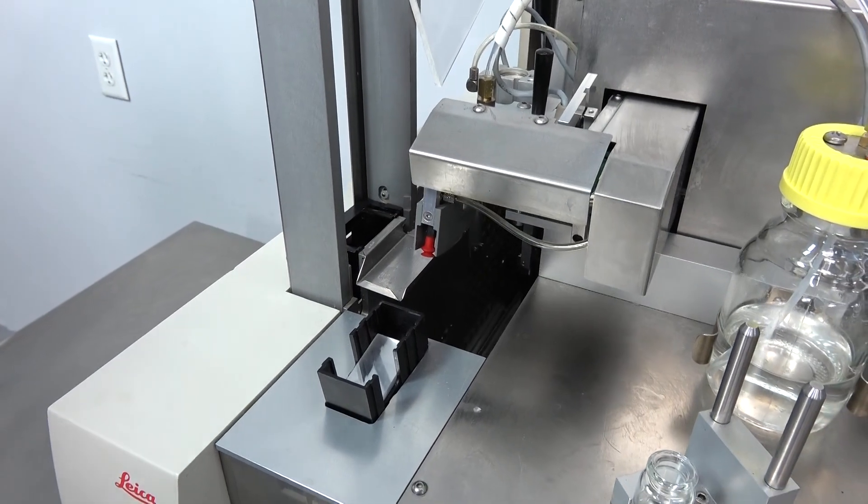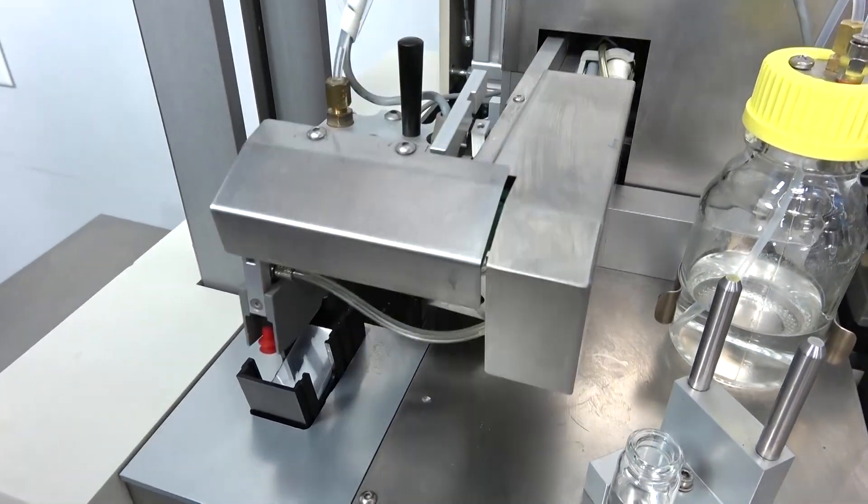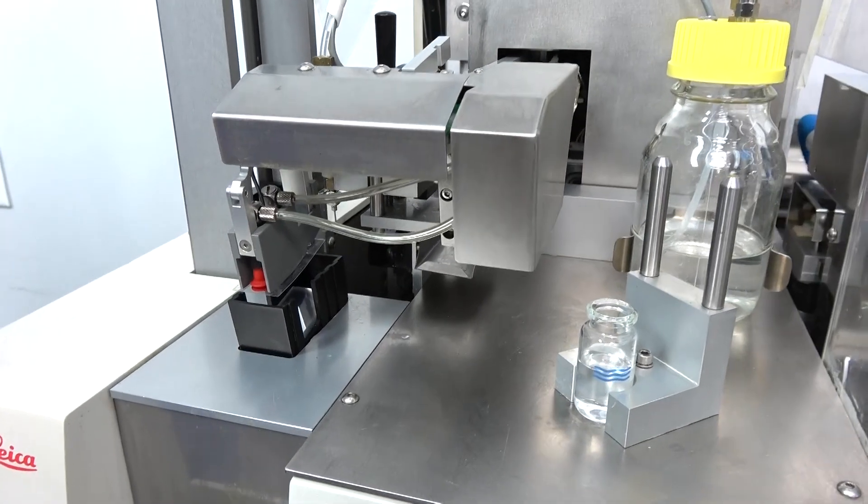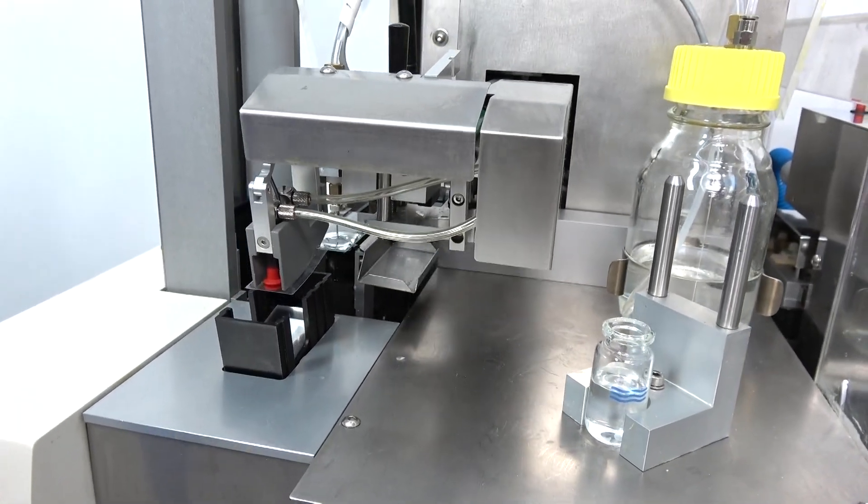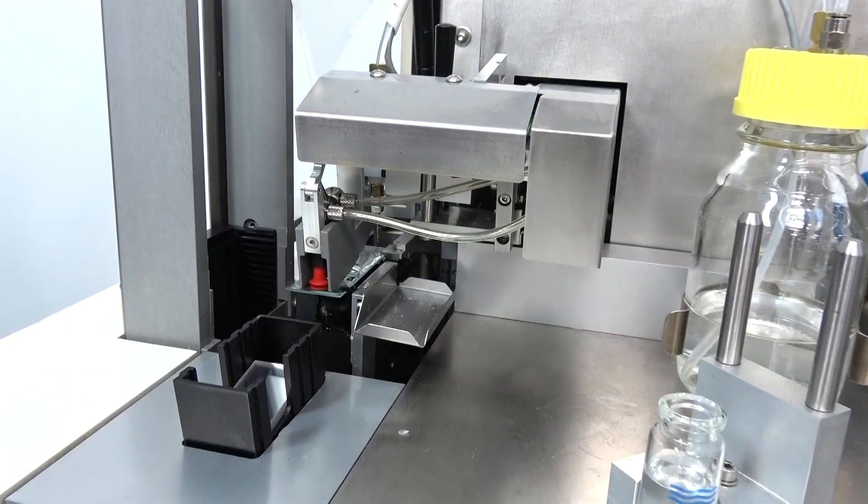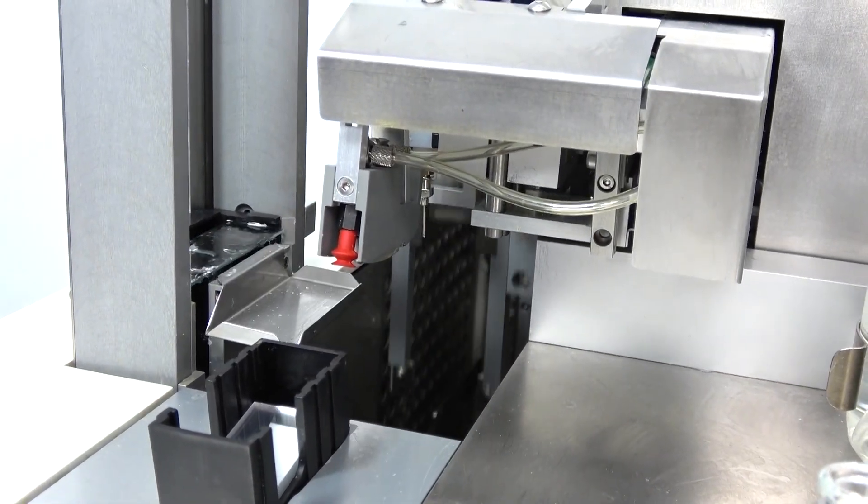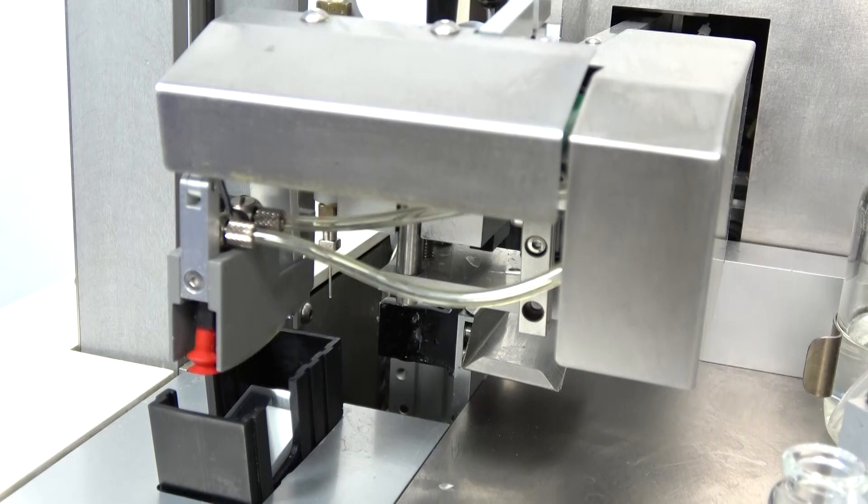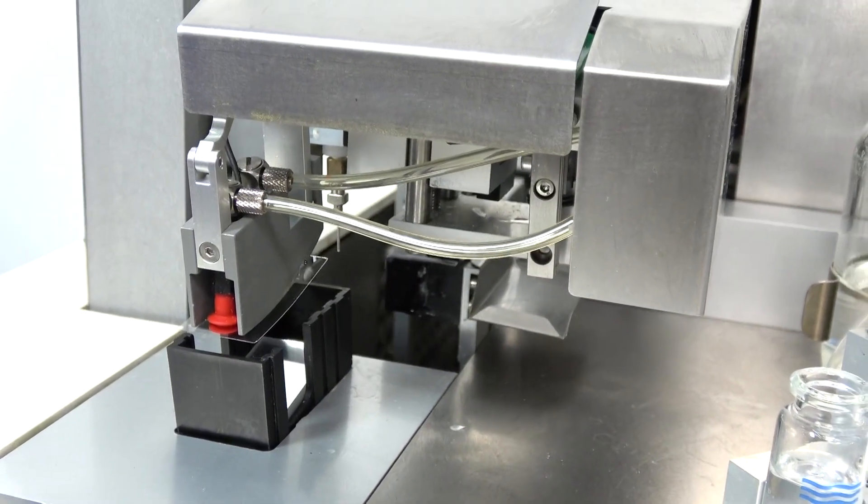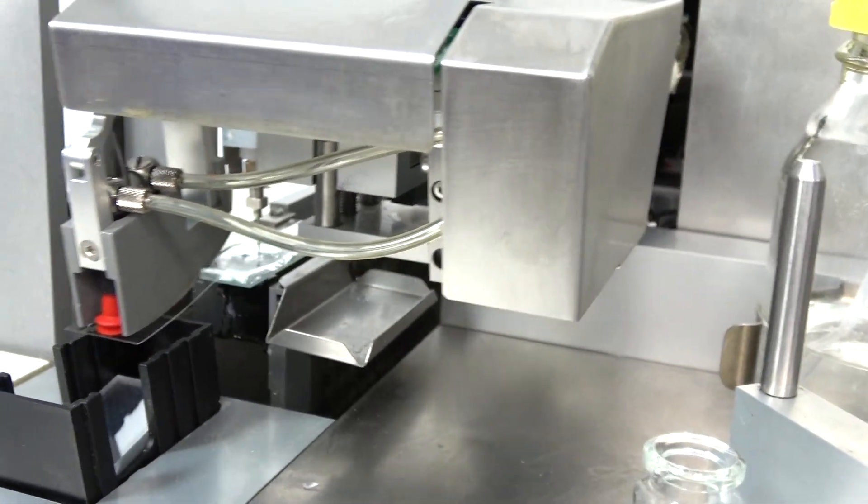Now we'll see it pick up the slide and it's going to suction the glass cover slip, load your liquid glass, and very nicely and evenly drop the cover slipper on so that you don't have any air bubbles on any of your slides or cover slips.